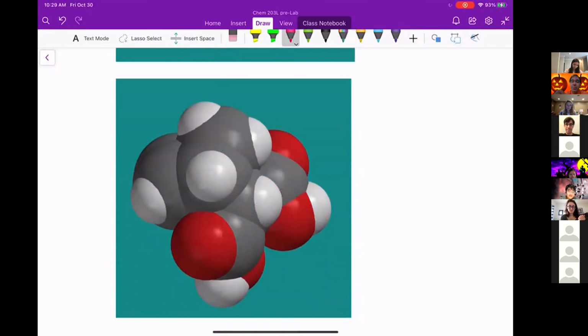Whoa, it's huge, but look at this. This proton and this hydrogen, or the proton and the oxygen, are like right next to each other. So they really do interact. All of the electron density on this oxygen affects that proton, whereas on the backside, you don't have one that's next door to it. Now, it is really close to this one as well, but that actually also happens on the back. So your bridgehead ones are equivalent.